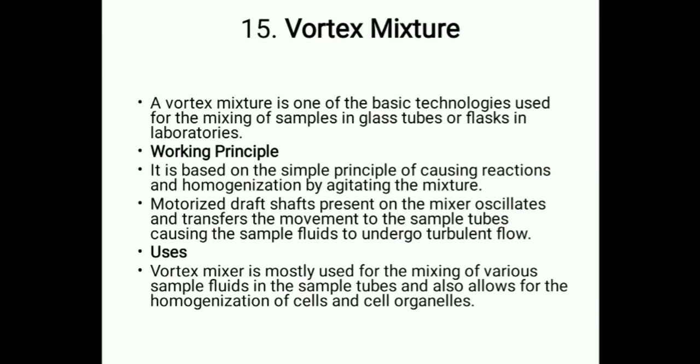Next we have vortex mixer. A vortex mixer is one of the basic technologies used for the mixing of the sample in the glass tube or a flask in laboratory. Talking about the working principle, it is based on the simple principle of causing reactions and homogenization by agitating the mixture.